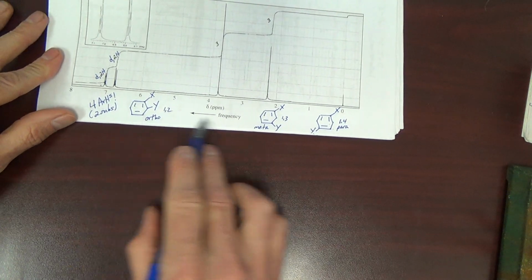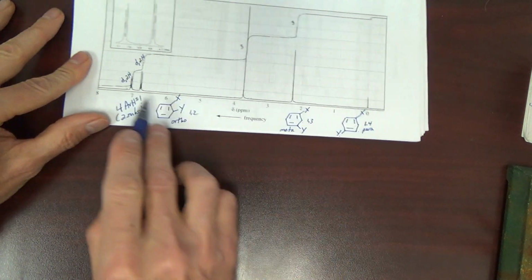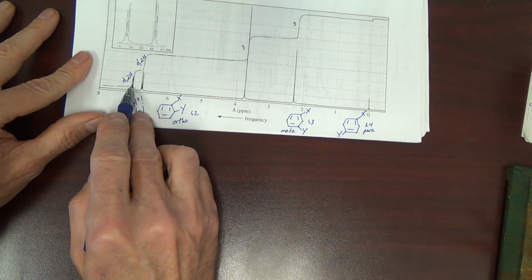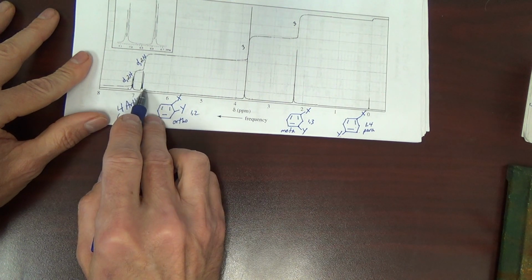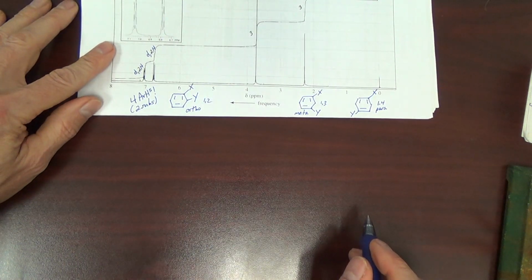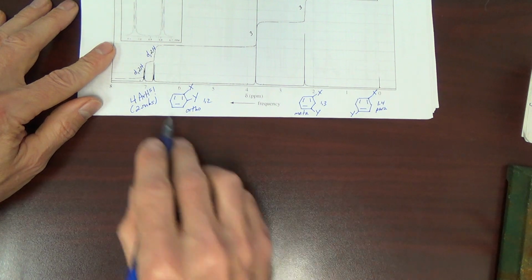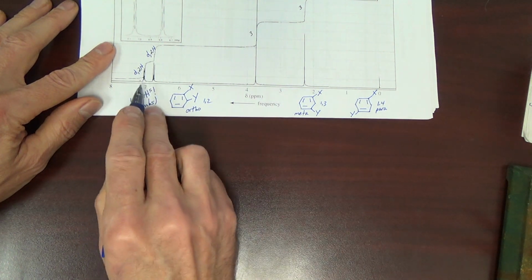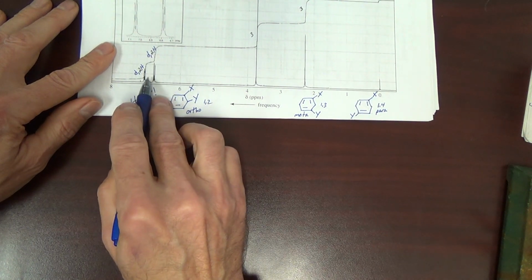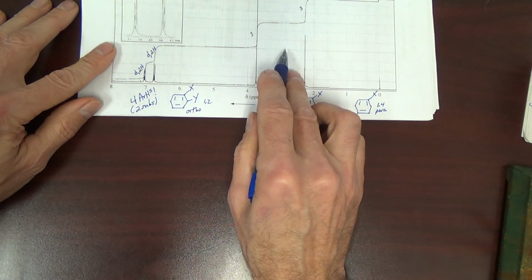Question: which of these isomers here will give 2 doublets in the proton NMR? 2 signals with each of them being doublets. All right. I'll let you think about that. It's one of these. This clearly indicates which one it is. Let's move down here.